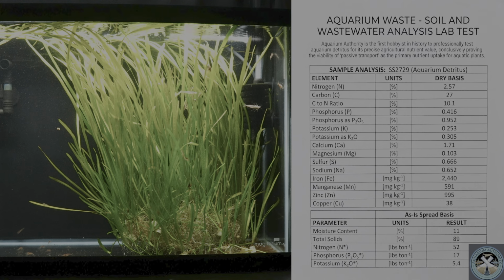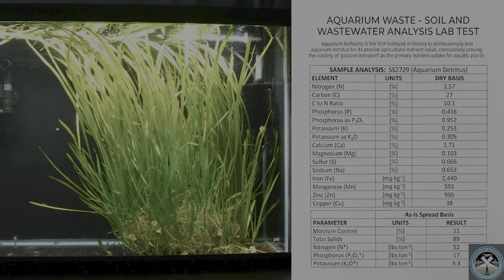So what we want to really look at here as far as the results are concerned, the carbon and nitrogen make up a C to N ratio, which is very important when it comes to growing plants when you're looking at an organic waste that's going to break down and feed your plants. I mean, you can't make this up, how perfect of a fertilizer this aquarium waste is.